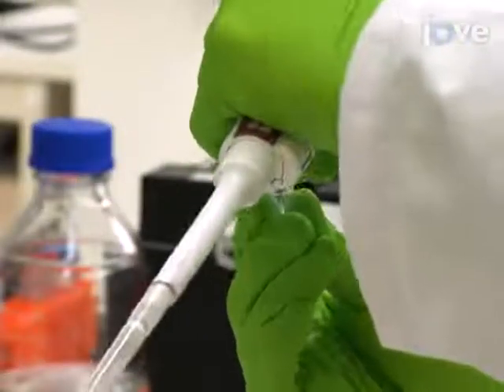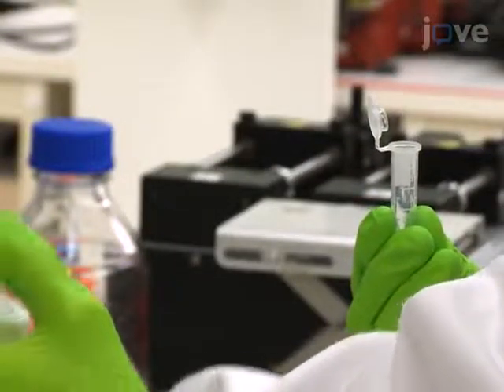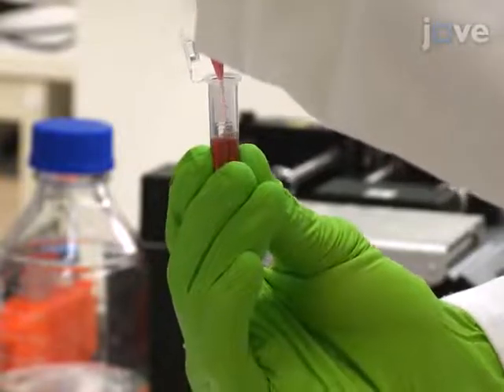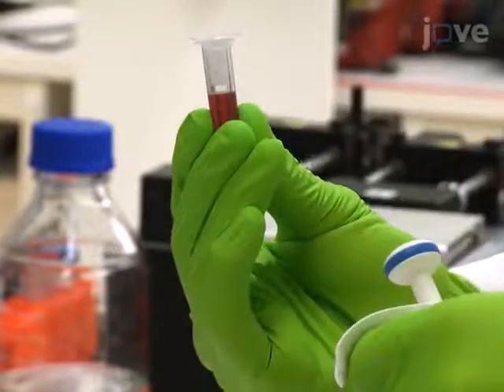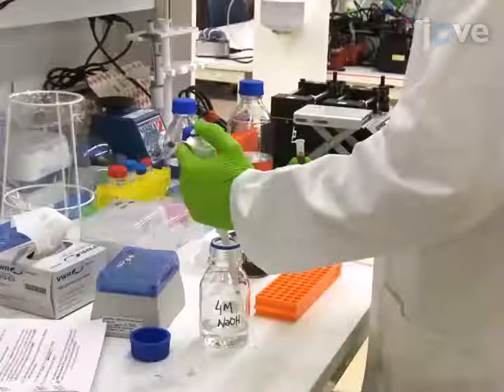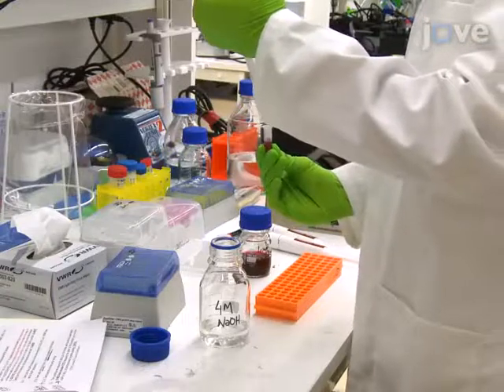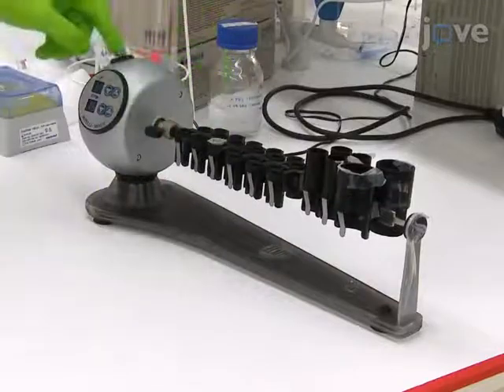Next, combine 1 milliliter of a 1.2 x 10⁻⁹ molar suspension of 40 nanometer gold nanoparticles with 1 milligram of alpha-mercapto-omega carboxy PEG and vortex the mixture. Adjust the pH of the mixture to 12 with a 4 molar sodium hydroxide solution. Gently stir the mixture at room temperature overnight.